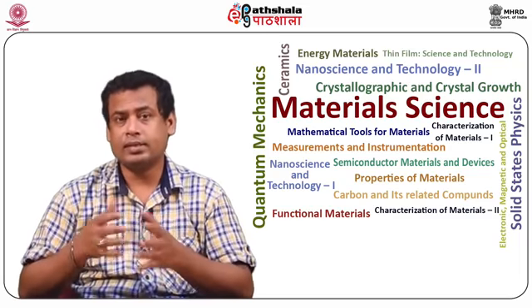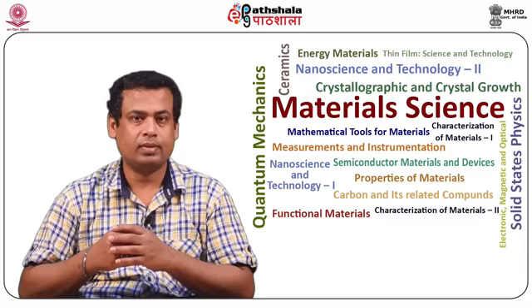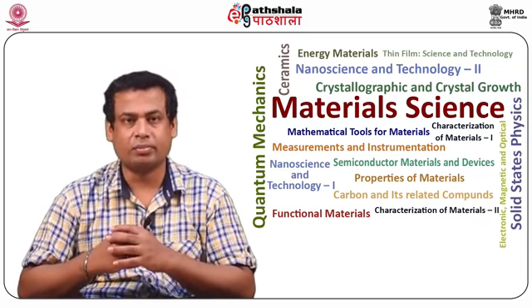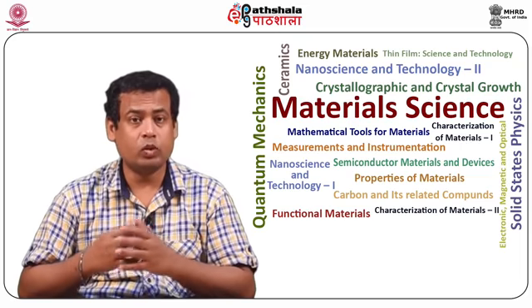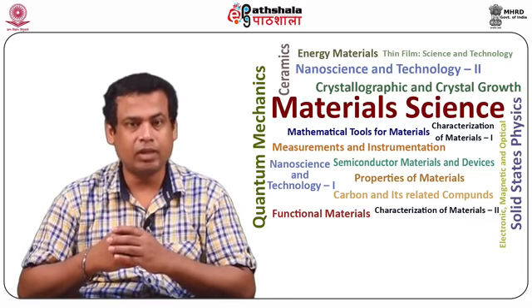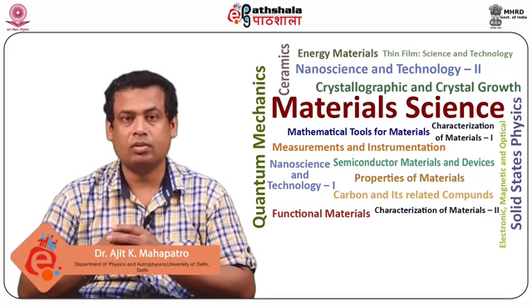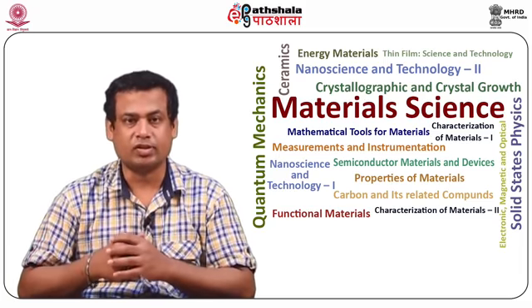So, students, let us now summarize what we have learned in this module. In this session, we have briefly described the elemental analysis of a thin film by backscattering spectrum. Various compositions of thin films, including single layer, multi-layer, single and multi-elemental thin films, have been discussed in detail. It gave an idea about how to analyze the backscattering spectrum in the case of thin films with composite structures. Thank you.